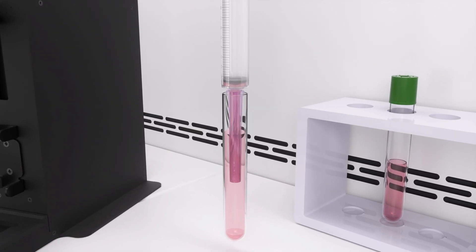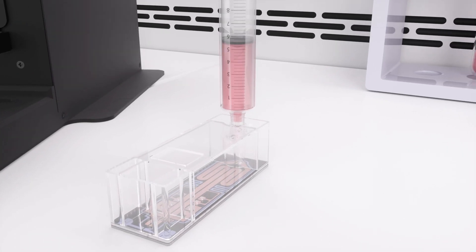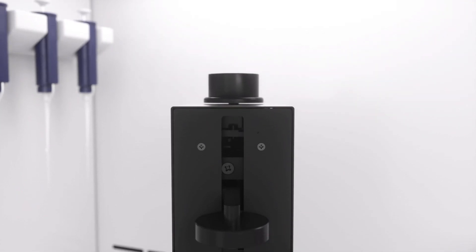How does this work? First, start by filling the luer lock syringe with cell suspension. Then, securely connect it to the inlet of Cell Puree and place it on a syringe pump to inject the cell suspension into Cell Puree.